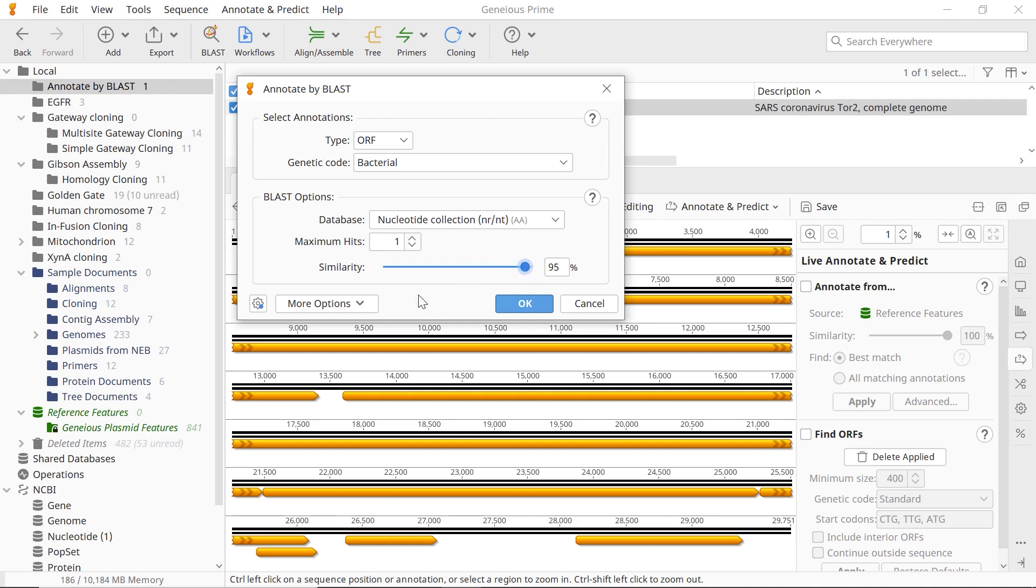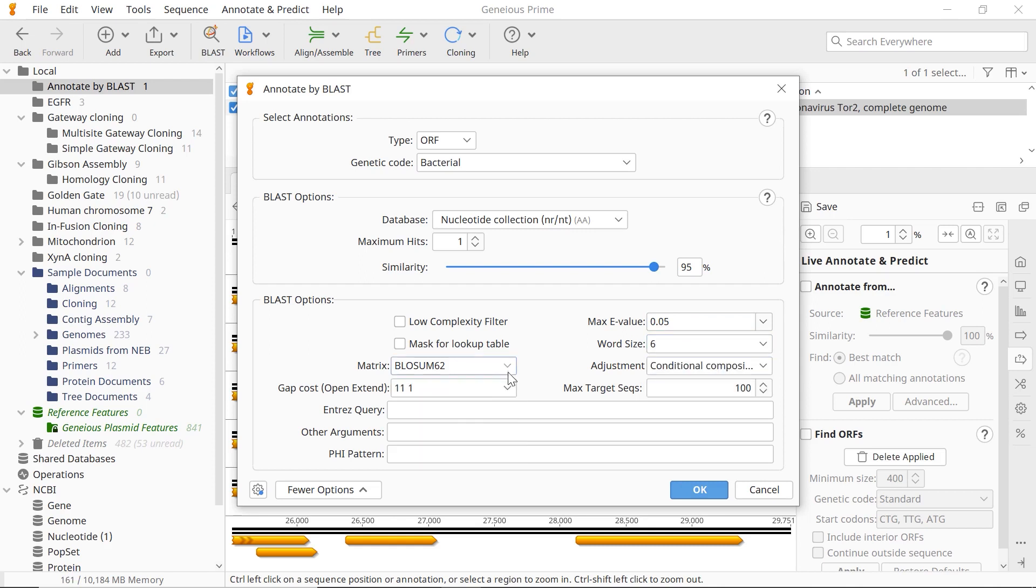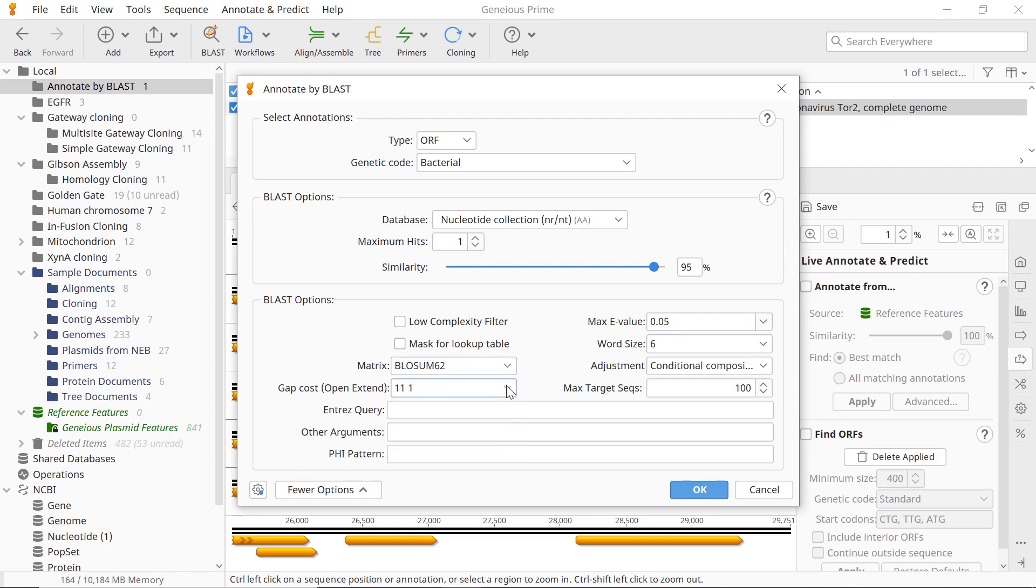Genius also allows you to set the BLAST parameters such as E-Value, Word Size, Substitution Matrix, and number of CPUs to use when running the custom BLAST.